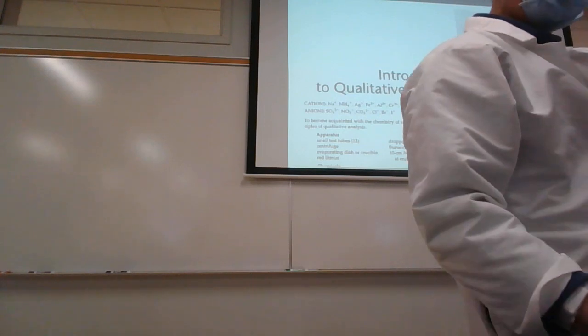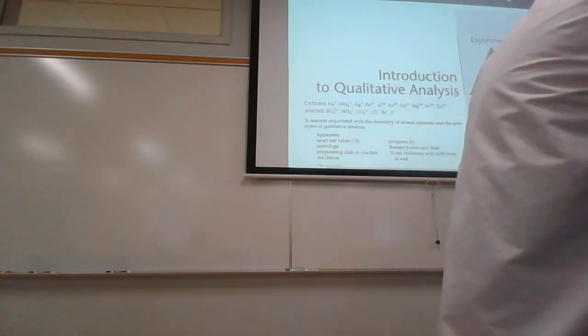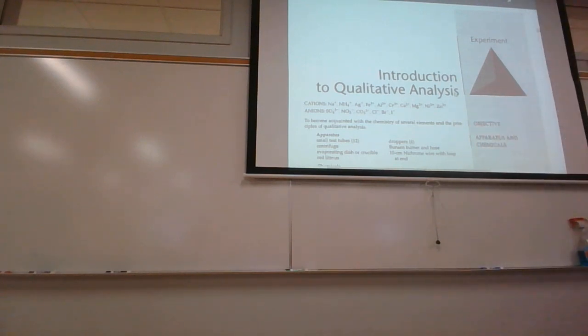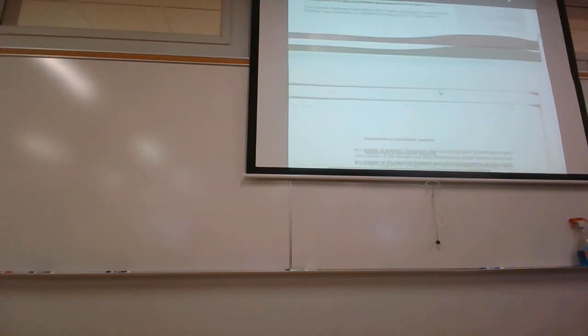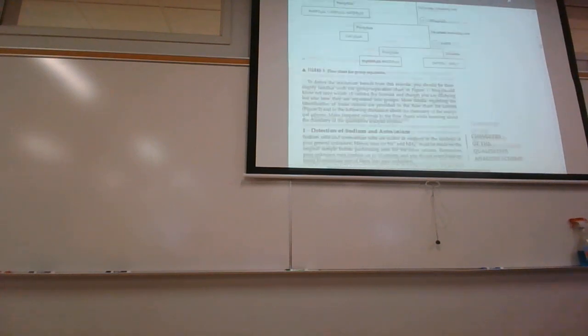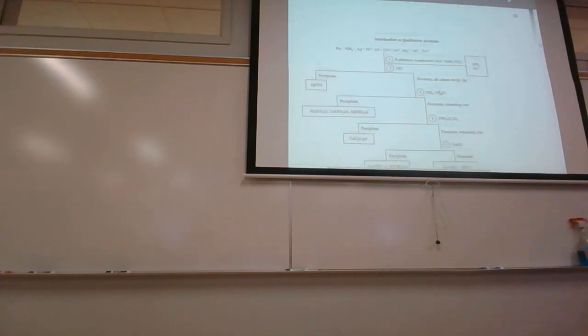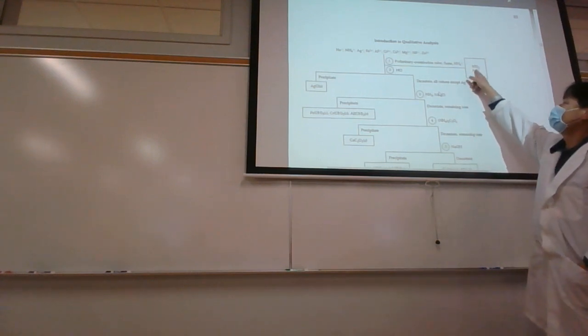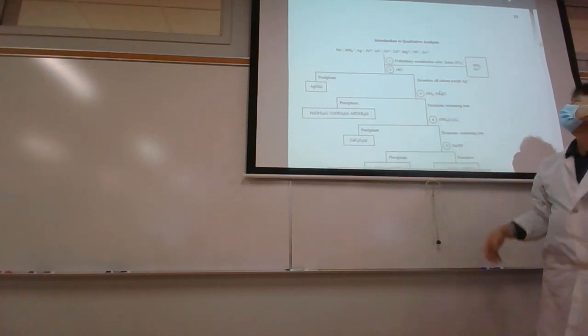Okay? It takes time, so I wouldn't start with the sodium. You can do the sodium at any time. We can also do the ammonia test at any time as well.